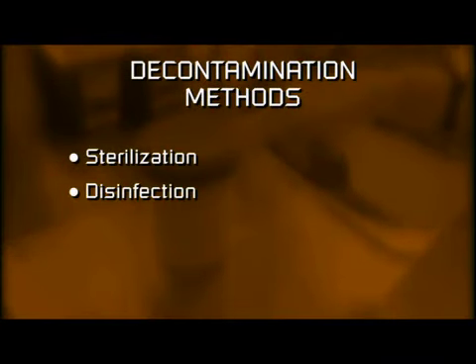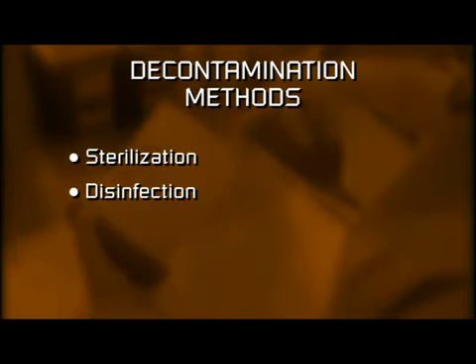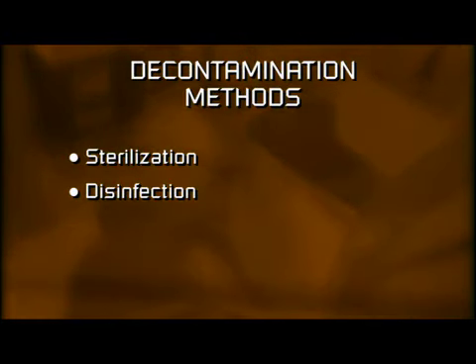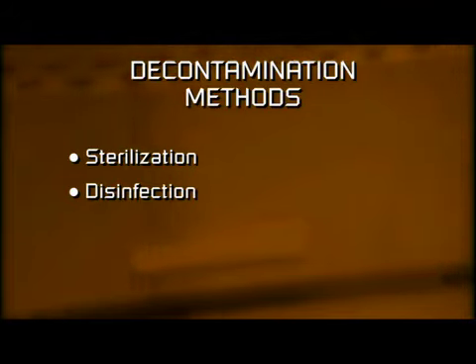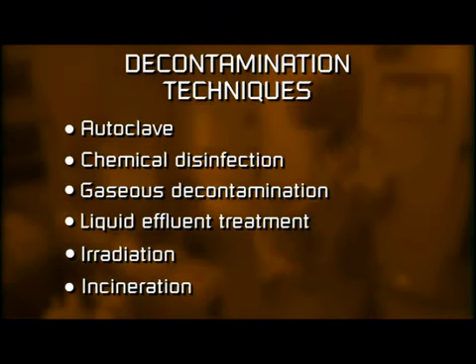Any materials or equipment leaving the Containment Level 3 lab must first be decontaminated. There are various decontamination methods. The method used depends on the nature of the material you need to decontaminate and the effectiveness against the microbial group in question. It must be emphasized that you need to be trained in all decontamination procedures related to the activities in your lab, and you should refer to the specific protocol developed for your facility before you use any of these techniques.